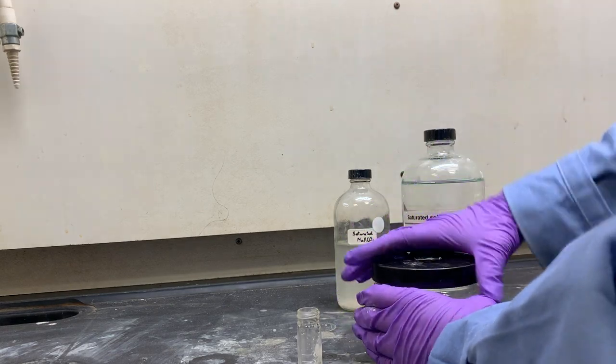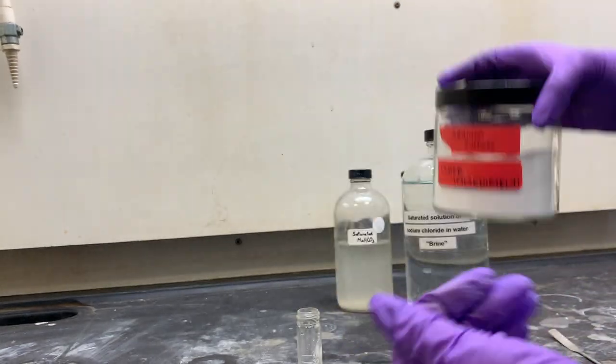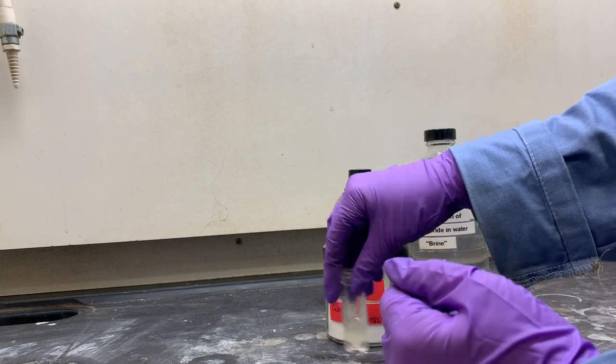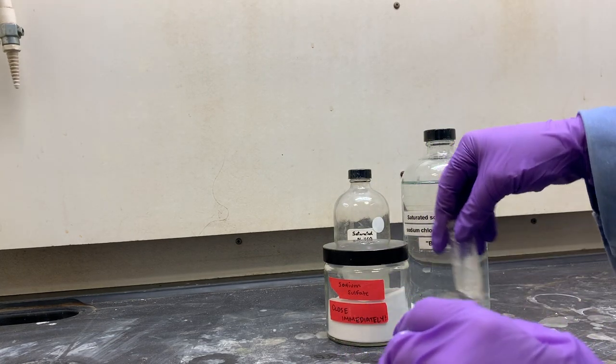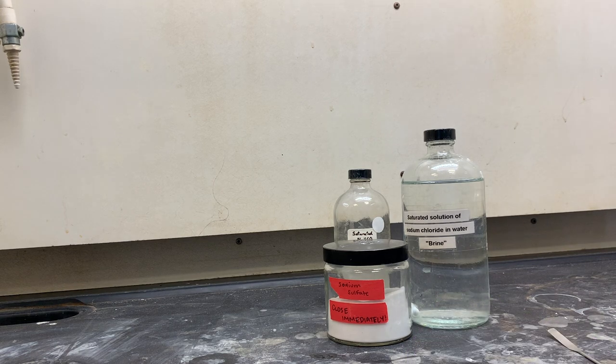Remove the drying agent and transfer the product to a clean, dry test tube or centrifuge tube. Add a boiling chip in preparation for solvent removal. Heat the test tube in a sand bath to remove the m-Xylene.